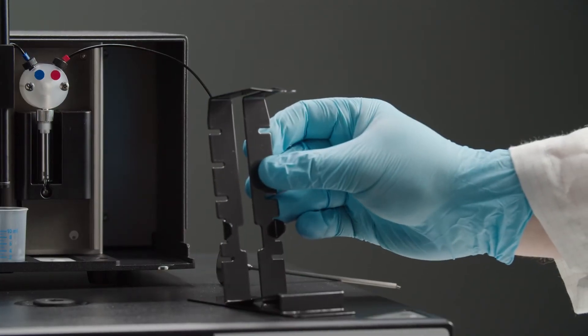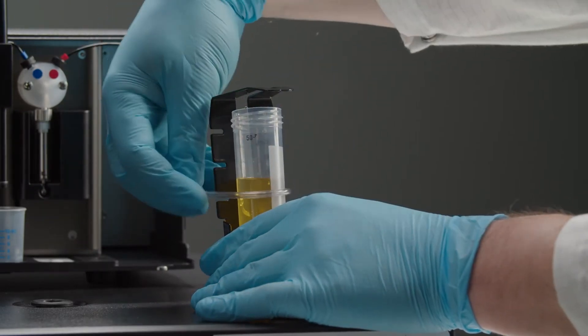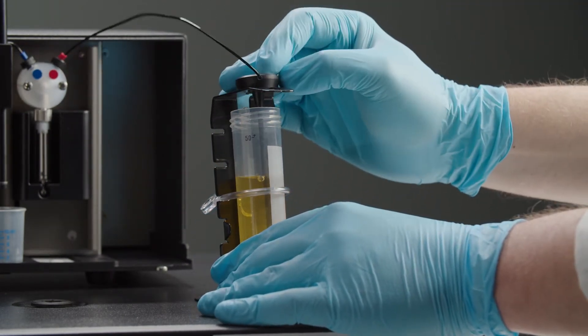Fill the storage bottles with the required reagents and put them into the holder. The carbon needle ensures that the tube reaches the bottom of the flask for optimal aspiration.